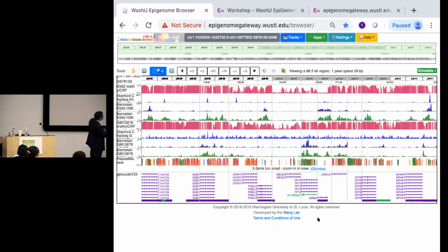I think maybe this is our first location. The regions are separated by gray lines. Unfortunately, we don't have the resolution to see this, but these are 20 regions, and the gray lines are separating the regions. I think this one is the region that we looked at first.